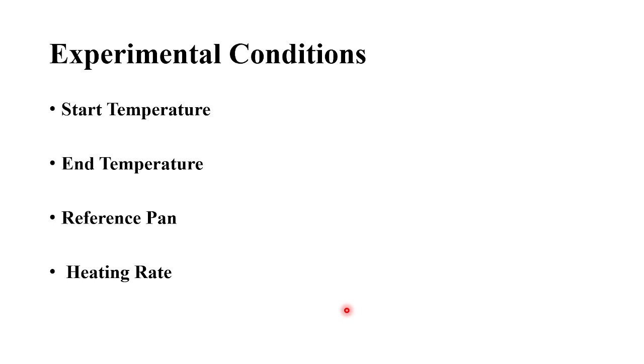and reference pan, and also the heating rate, whether we will go from lower to higher at 10 degrees centigrade per minute, it should be predetermined.